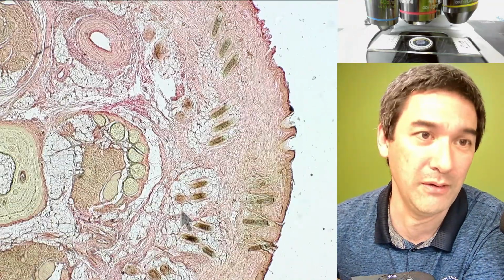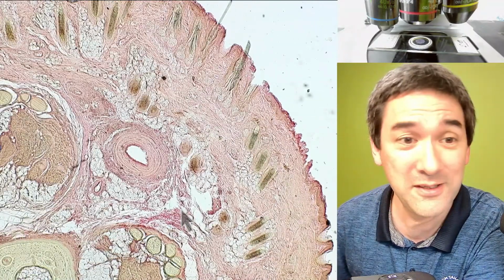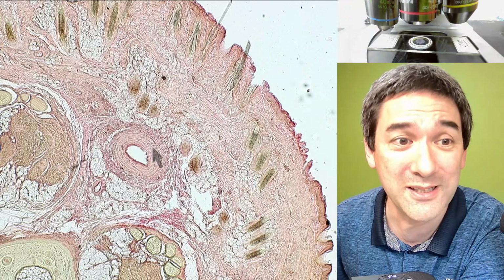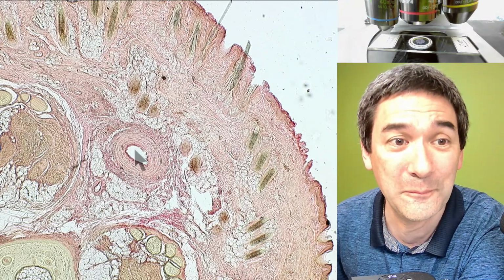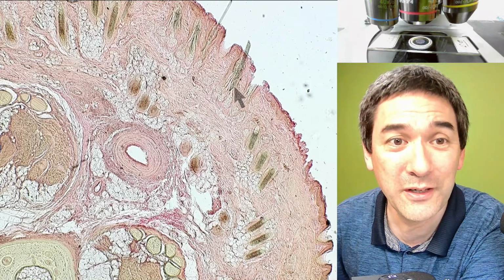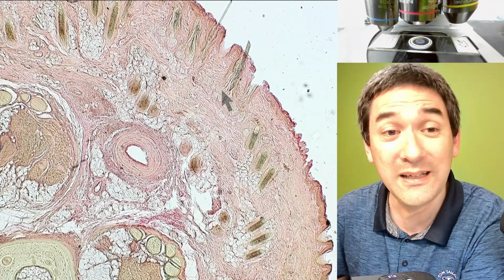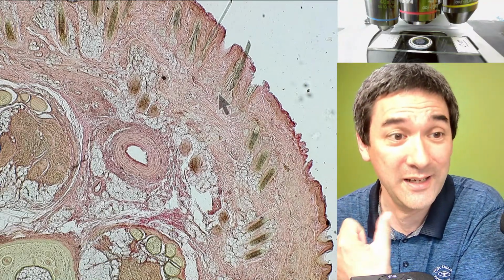What I thought, at least I thought interesting: this one over here, this guy over here. Look at this. Do you see this here? What is this here? It's an artery. It's a blood vessel. How do I know it's an artery, not a vein? Because it has such a thick wall. You see over here again one of those fur hairs growing out. So I think this is a really nice slide.